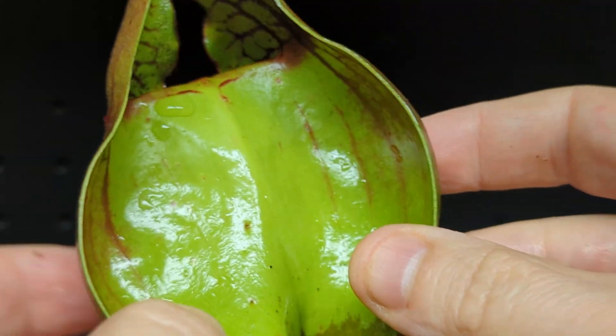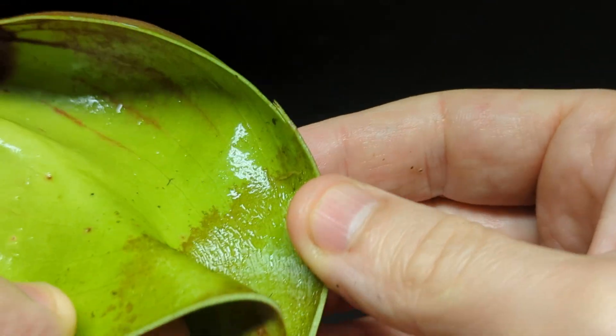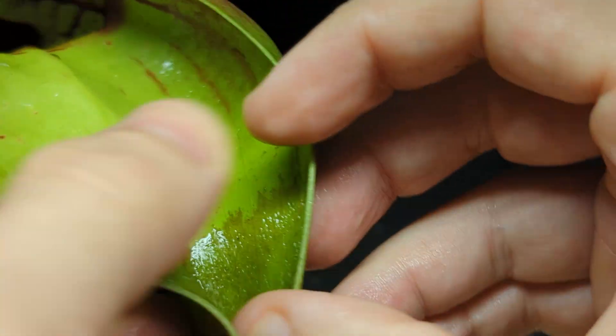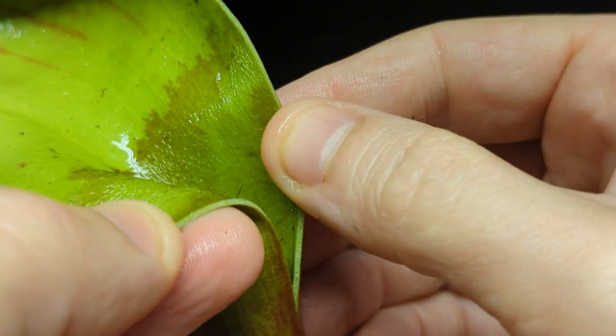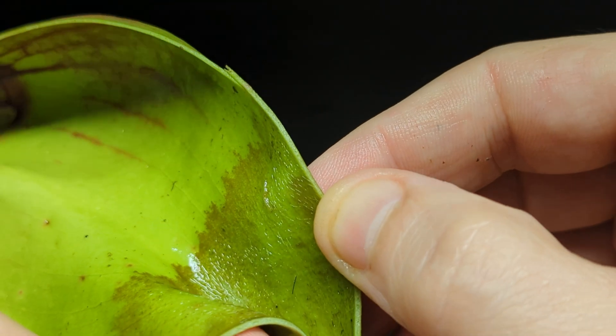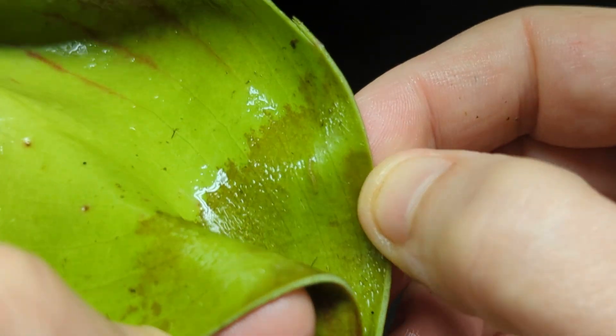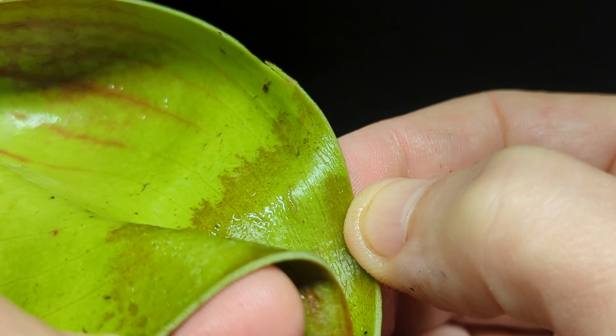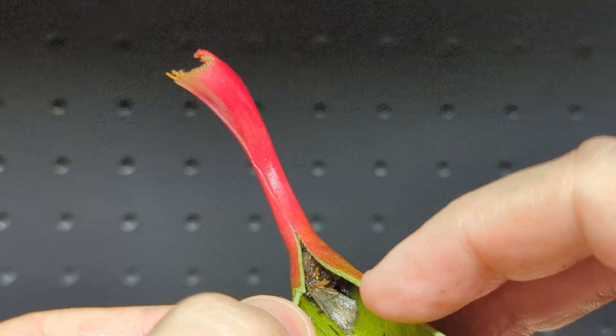The teeth make animals slide in, and remember the water fills all the way up to the brim. But down here we have very fine little hairs, and this region is called the detentive zone. Looking at old literature, people suggest these hairs are for detaining insects that get trapped inside — that's why it's called the detentive zone — but that doesn't really make sense.